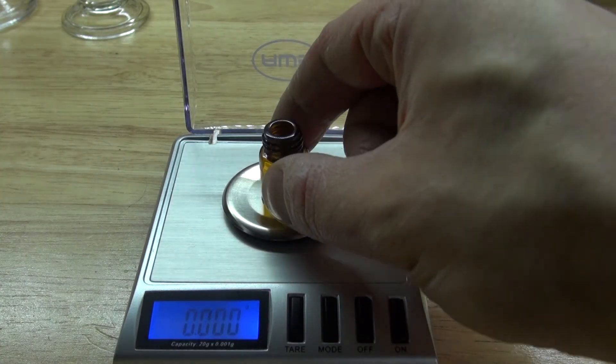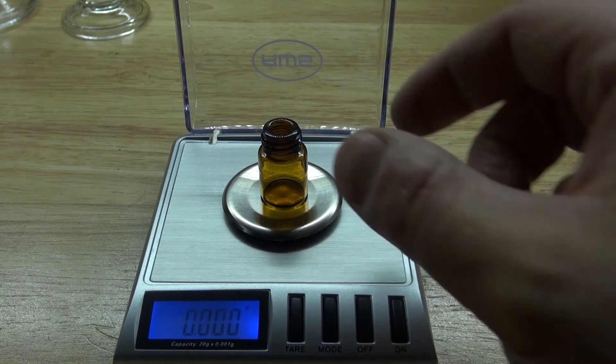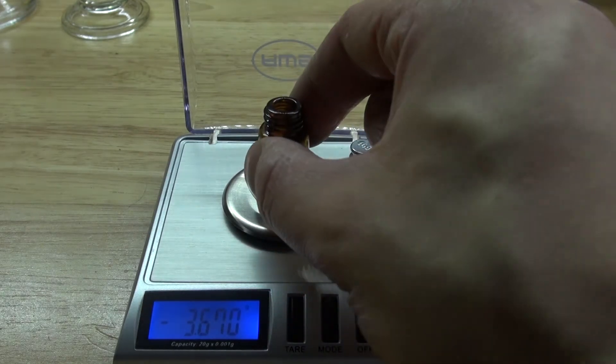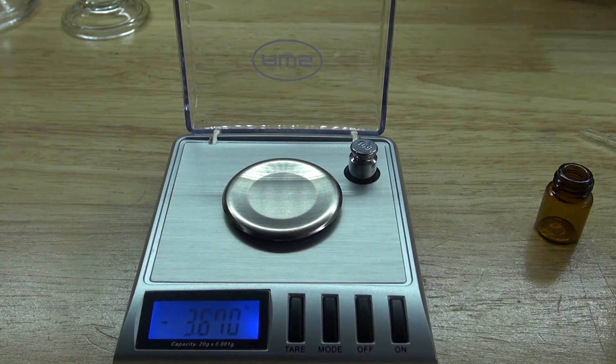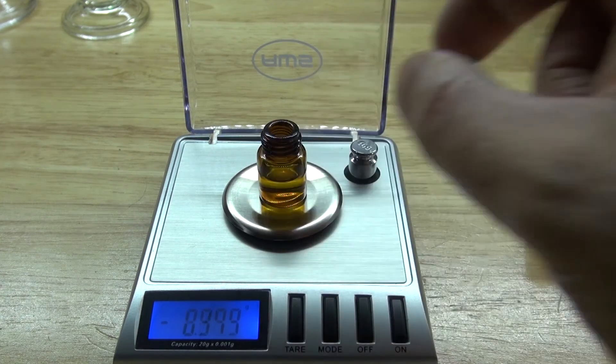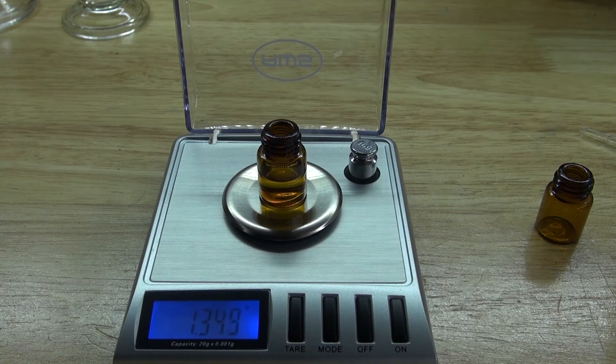Next I'm going to take an empty amber vial, put it on top of my scale, and tare it. I'm going to go into my other amber vial that's containing the rosemary essential oil and concentrated rosemary hydrosol. As you can see I've collected 1.35 grams of rosemary essential oil and concentrated rosemary hydrosol.